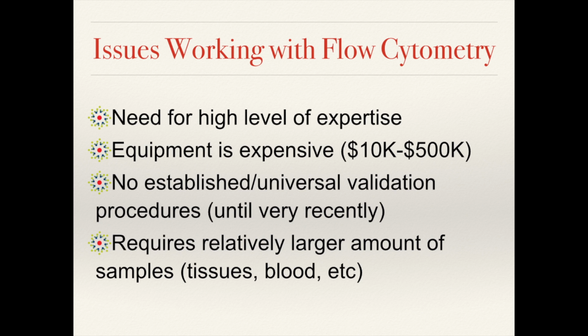The equipment is expensive and can range from $10,000 for a very basic unit to over $500,000 for advanced systems that can measure over 30 parameters.